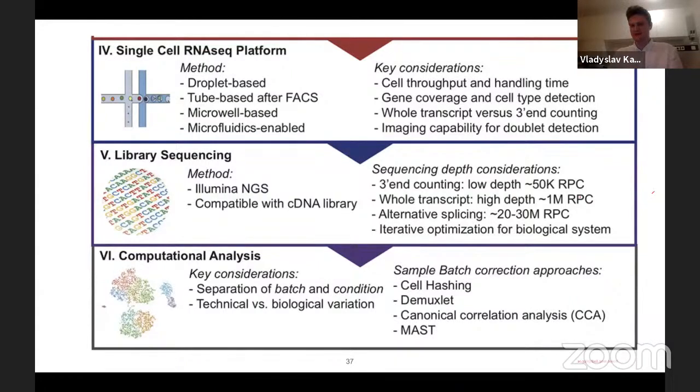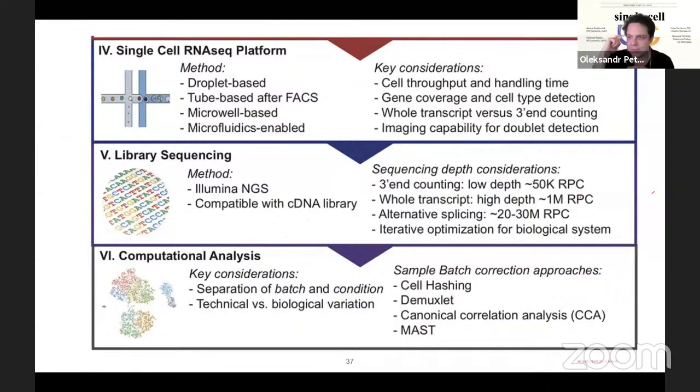Regarding the sample size, especially in techniques such as single cell RNA sequencing, it always depends on the amount of money that you have. Let's say it clearly: it's a very expensive method and it costs really a lot. That's why it depends on the budget you have in your lab. But I would suggest that you should minimally have N equal to 3 or N equal to 5 in each of the groups that you're investigating. Super nice that you mentioned funding, because the next question is related to funding. If you're limited in money, would you include more individuals or rather increase the depth of sequencing? That's a nice question.